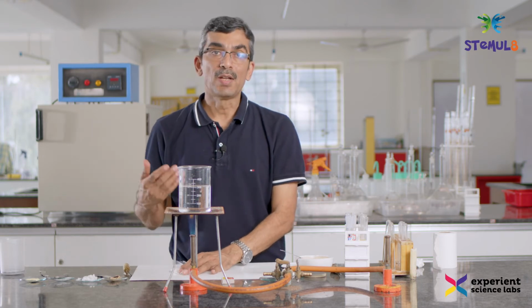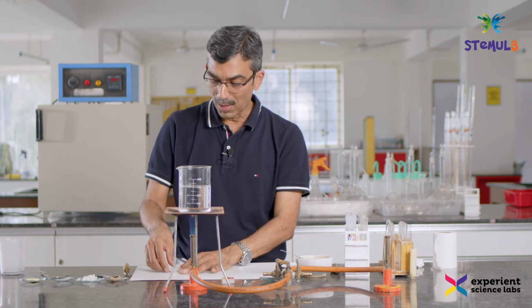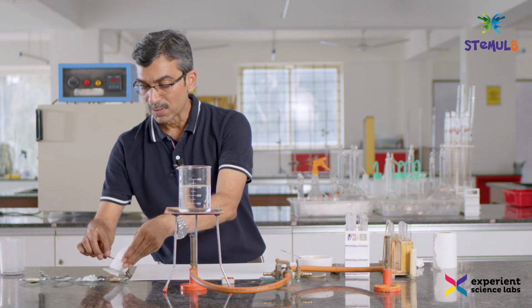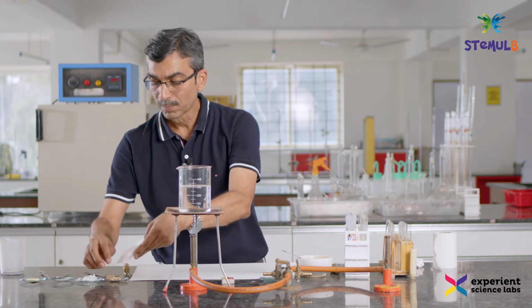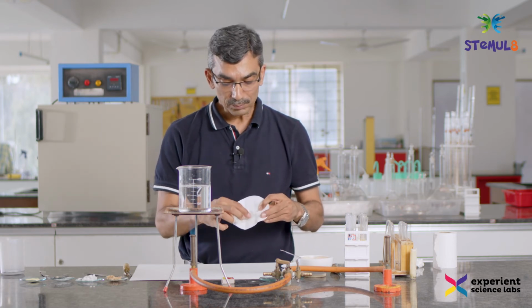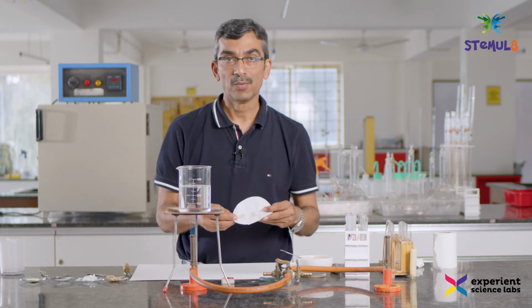What happens is that if it has oil, then it will come out, and it will leave patches of oil on the filter paper, and we can see that against the light, and it will be very clearly visible. So let me not throw this away, I will keep this aside. And I can see the patches of oil on the paper. These patches show that it's obviously oil, or fat, from the groundnut.